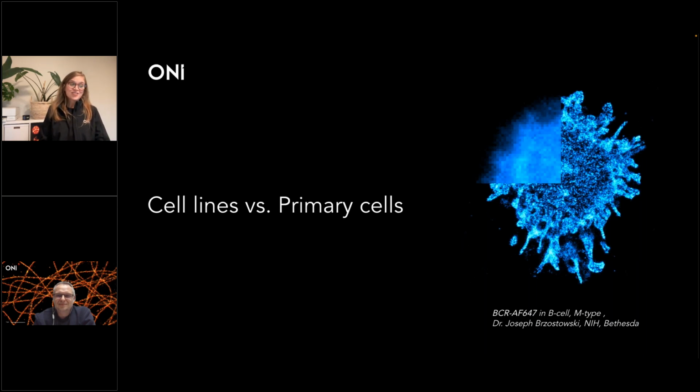And we have another LinkedIn Live question from Lisa from Florida. Welcome. The question is, do photobleaching dynamics change? What is the difference between conventional fluorescence and super resolution techniques such as dSTORM or DNA-PAINT?